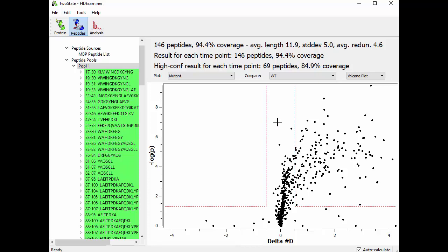that it isn't just noise. Because our replicate data tells us that these points here could actually be within the noise despite the fact that their P value is low.